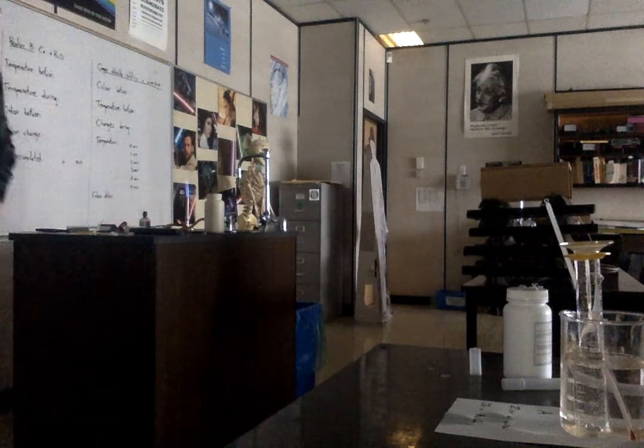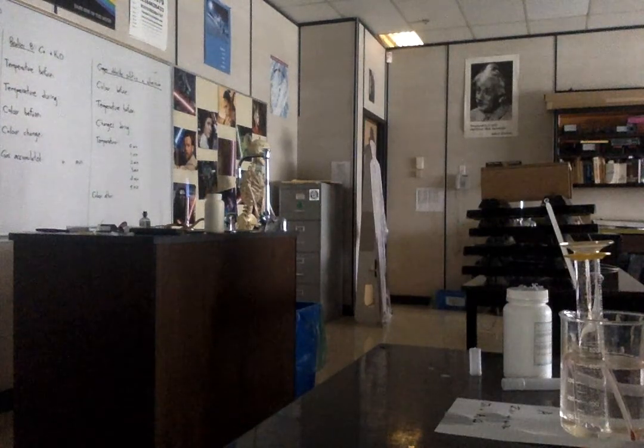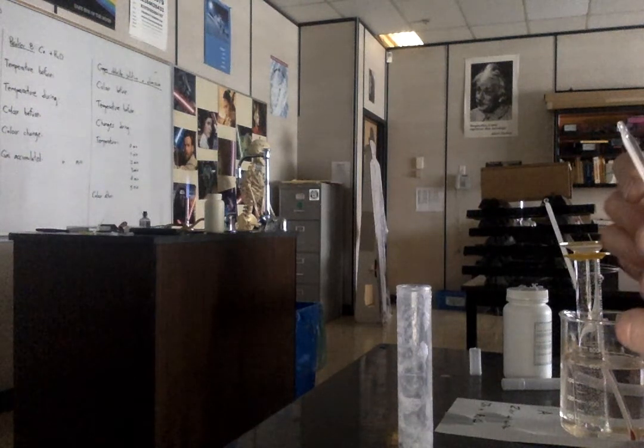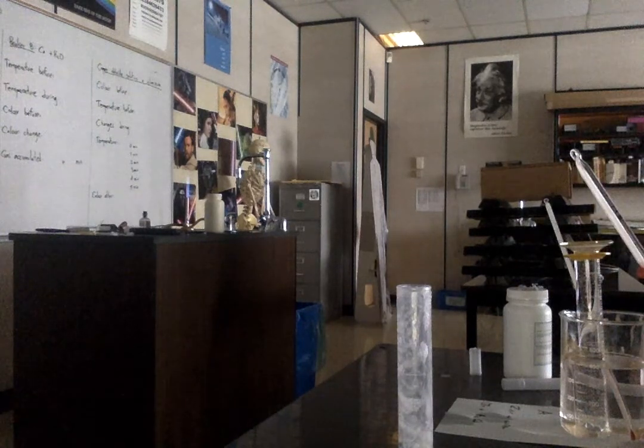Didn't do quite what I was hoping it to. I think possibly adding the soap was maybe actually a mistake, but live and learn. I'm going to try something different now. The temperature, by the way, of this solution has now reached 23 degrees Celsius. The temperature of the zinc is stable.